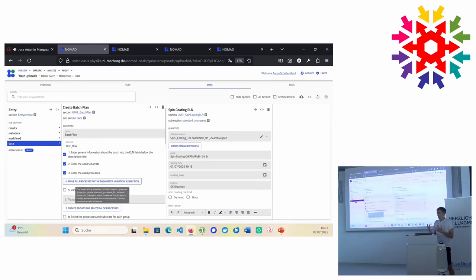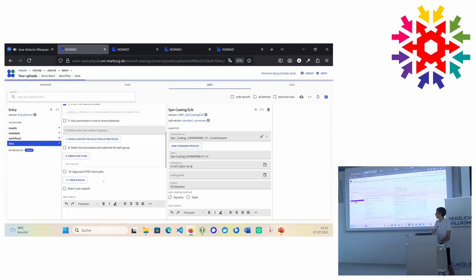The next important step of an experiment is always a variation. Typically, you have one parameter variation. So I click this button and move all processes now to a section called parameter variation. There are 2 ways I can vary parameters. Either it's a single parameter, or if it's a more complex variation and I have to change more than one thing, then I have to go a little bit a different way. But it's also possible in this setup here.